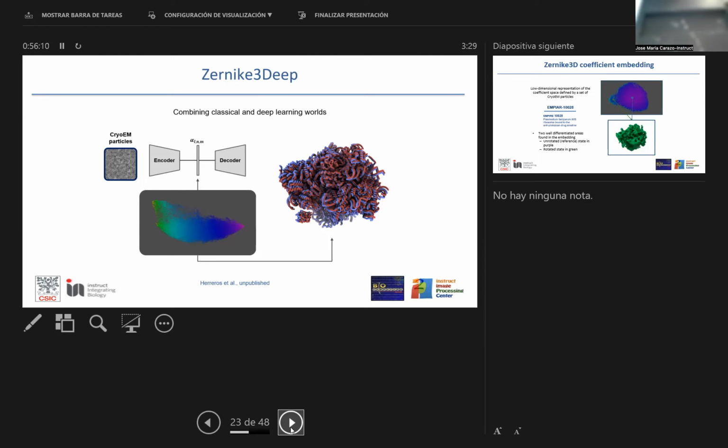Thank you. Another question about symmetric particles. Are those methods problematic when it comes to symmetry, because of misalignment and variability? Yeah, you are completely correct, and we haven't done much about that.